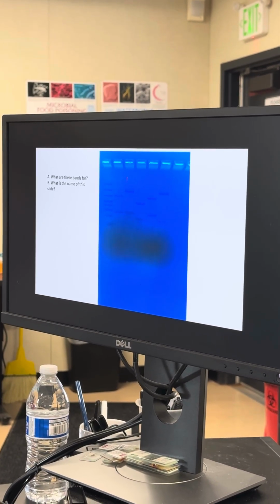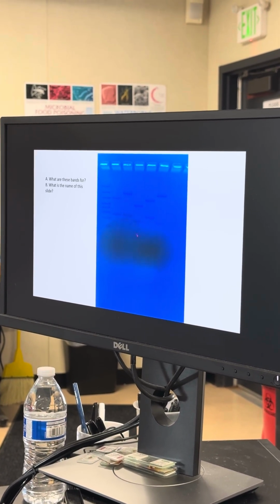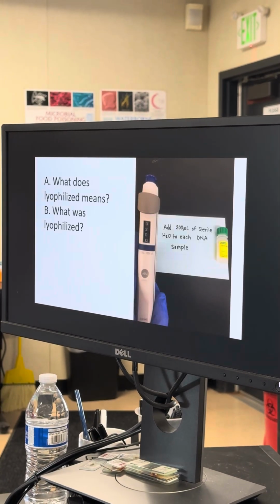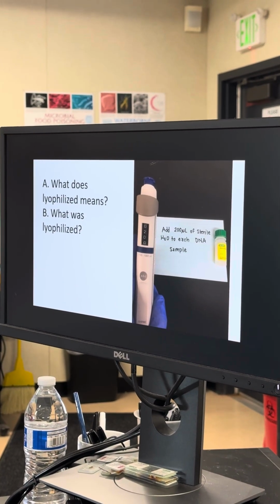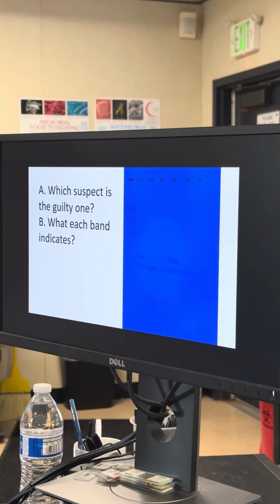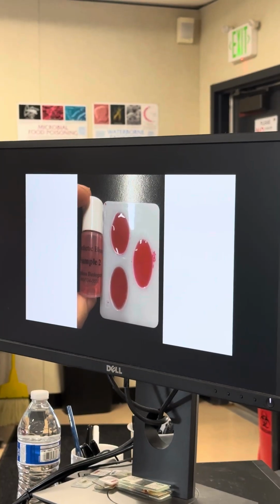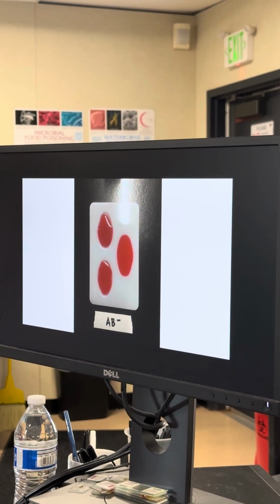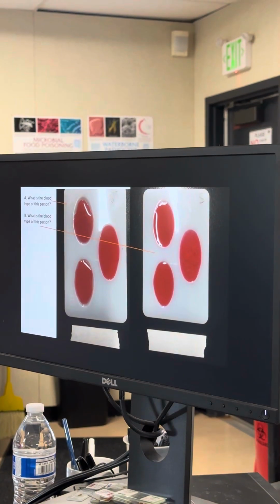Capital A, capital A, capital A, small a, small a, small a. And then these two guys, there should be another one, but anyhow, there's not one. None of these, well, the criminal, you guys know, we talked about it before. Blood typing, of course. So what else? Corn is coming up.